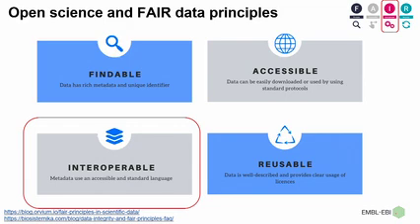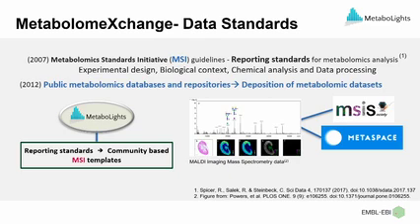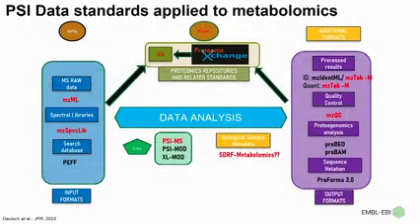Okay, in the context of interoperability, the I of FAIR, Nils Hoffmann will be giving more information about it later, but I want to highlight here the importance of having data standards that are interoperable between tools and data resources. It is not possible to have 20 different parsers for 20 different data formats and the different versions. So ideally, there should be some community-supported data standards. There are some, for instance, mzML is becoming quite used for mass spectrometry data, but we really need, I think, one format for processed results.